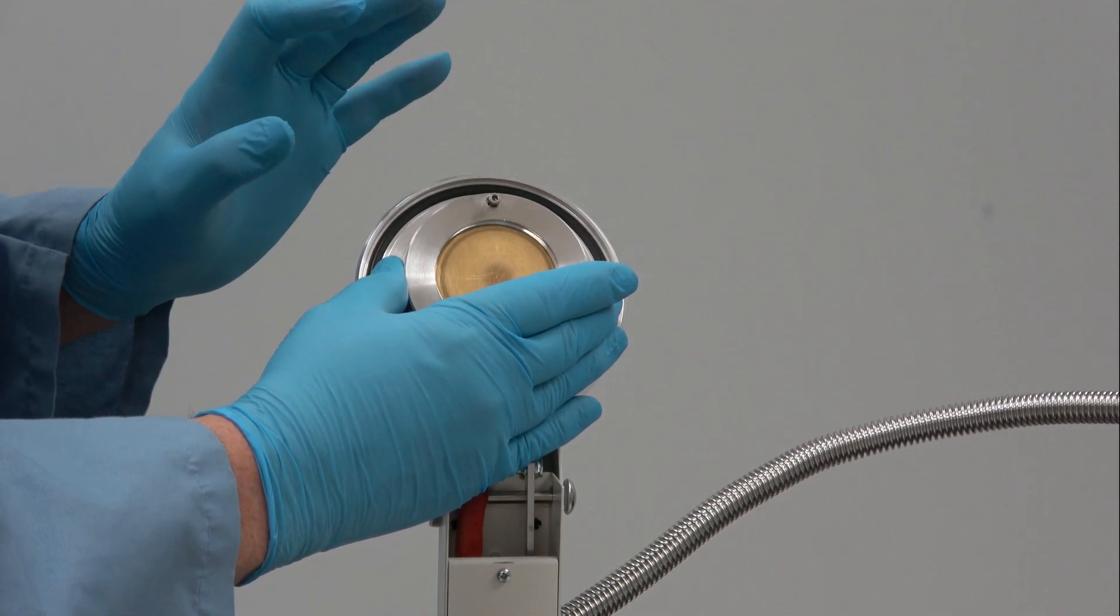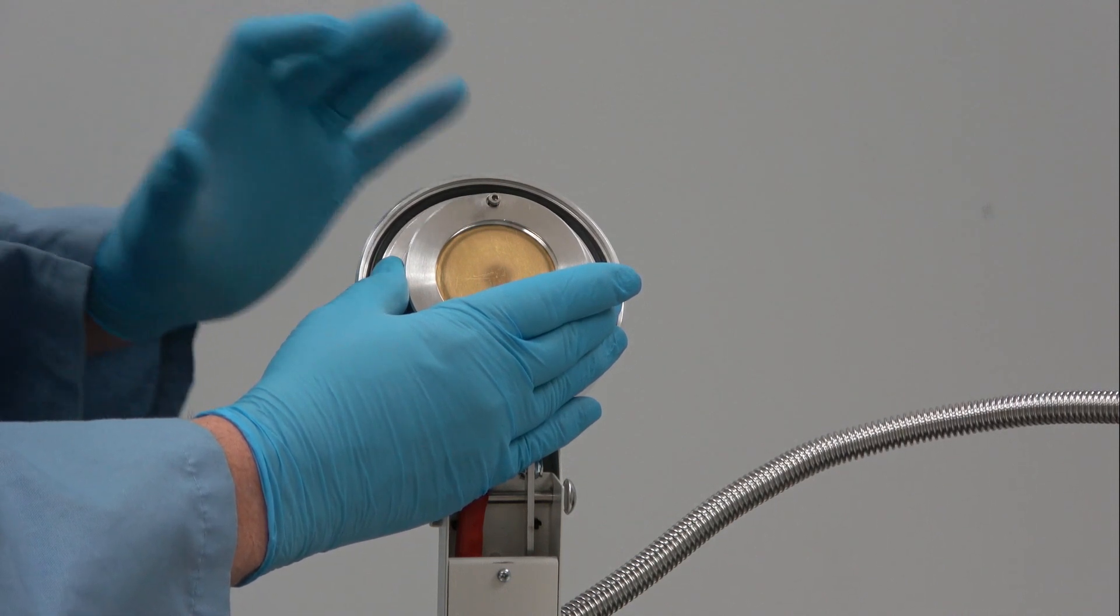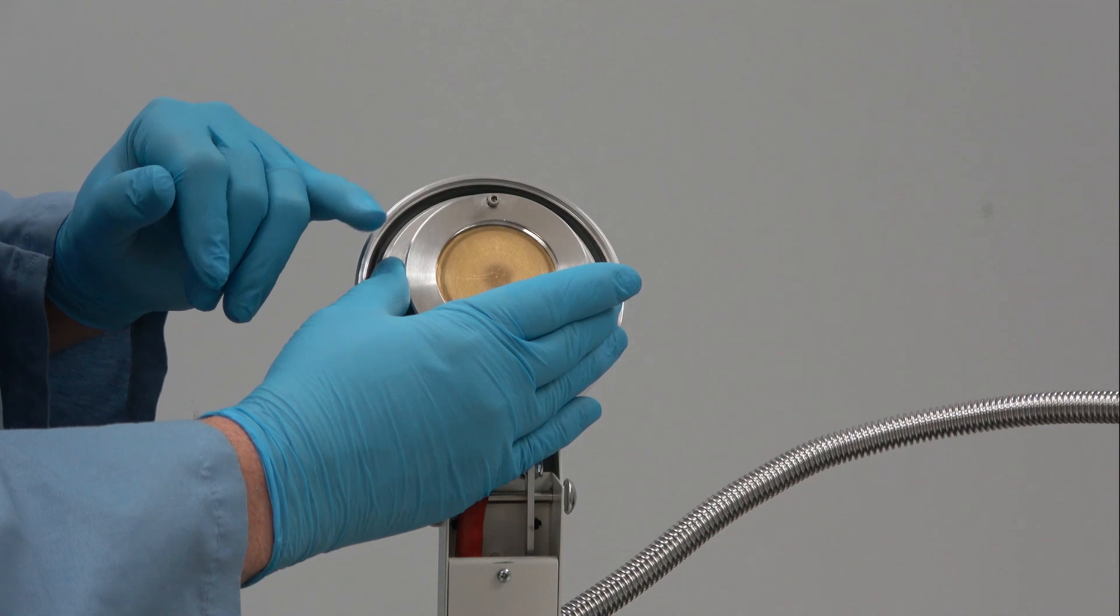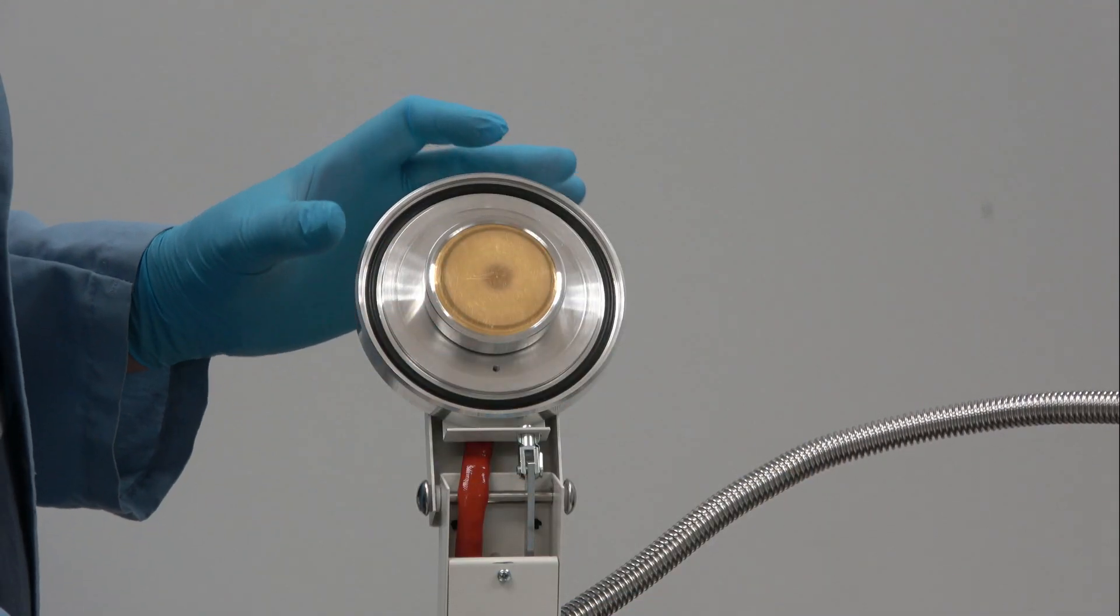So that's the correct installation of targets in the 7620. If you need to change the target, you just go through the same exact procedure.